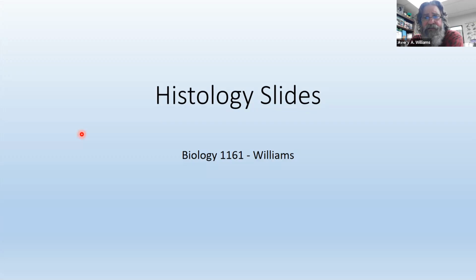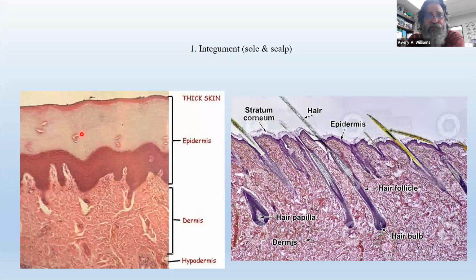And so what I did is, rather than forcing you guys into lab and preparing slides and studying slides, which takes a while, I just took pictures of everything and look at it like that. So you're going to kind of get gypped on the microscopy skills, but most of you are never going to probably touch a microscope after the semester anyway.